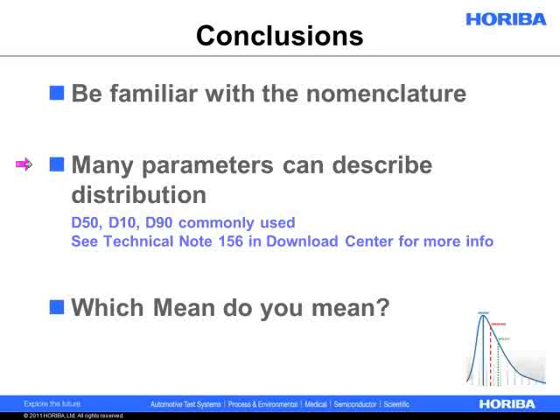And I'd also recommend monitoring multiple parameters if possible. It's always a difficult situation when we encounter users who have specifications only on one parameter, like the D50 or the mean value, and their distribution is just very complex, right? If you were to actually look at the size distribution graph, you might see multiple peaks or just all sorts of interesting information that's very hard to capture in only one parameter.